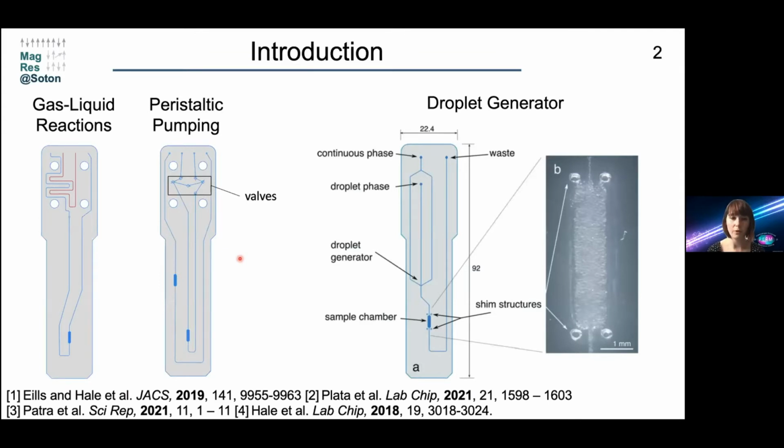Here I'm showing a couple of designs. The first one is just for gas liquid reactions, which I will discuss in detail in the remainder of the talk. Others allow us to perform peristaltic pumping or droplet generation.